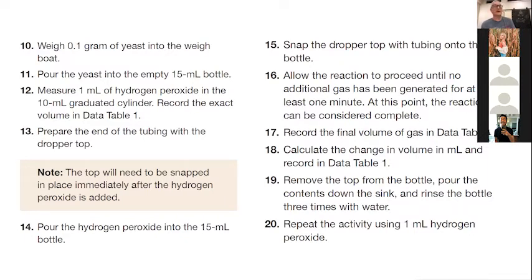It isn't terribly important that we get exactly 0.1. That's why it doesn't say 0.10 or 0.100. It just says 0.1, meaning anything from like 0.05 to 0.14 grams is fine. That's a lot of leeway. But why isn't it important? So that was a good guess, huh? Well, sometimes it's better to be lucky than good.